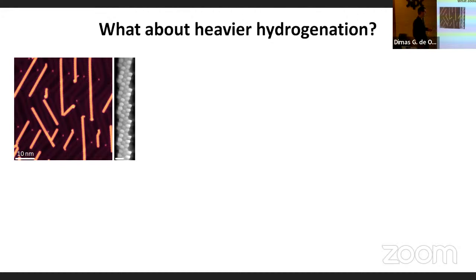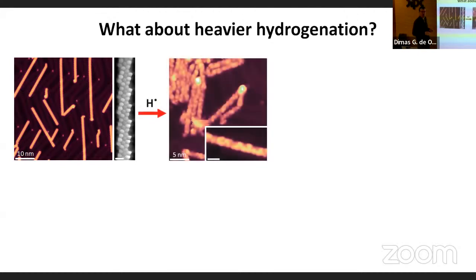So we have a hydrogen cracker, we dose our atomic hydrogen into our UHV chamber, and this is how the ribbons look afterwards. This looks really messy. This is because not only the edge atoms, but also the interior atoms hydrogenate and then rehybridize from sp2 to sp3. And then the whole structure becomes buckled, non-planar and everything. That's why it looks so messy here.